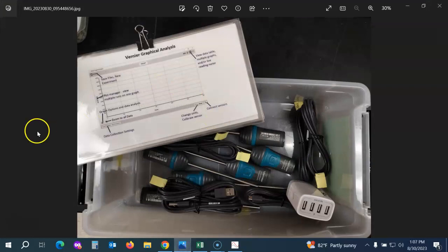Your Advancing Science Loan Kit will include a classroom set of sensors, usually eight to ten sensors, so students can work in small groups. In addition to the sensors, the tub will also contain a set of USB plugs. You can use those to charge your probes on the small charging block, or the plugs can be used to connect the probes directly to the student computers.